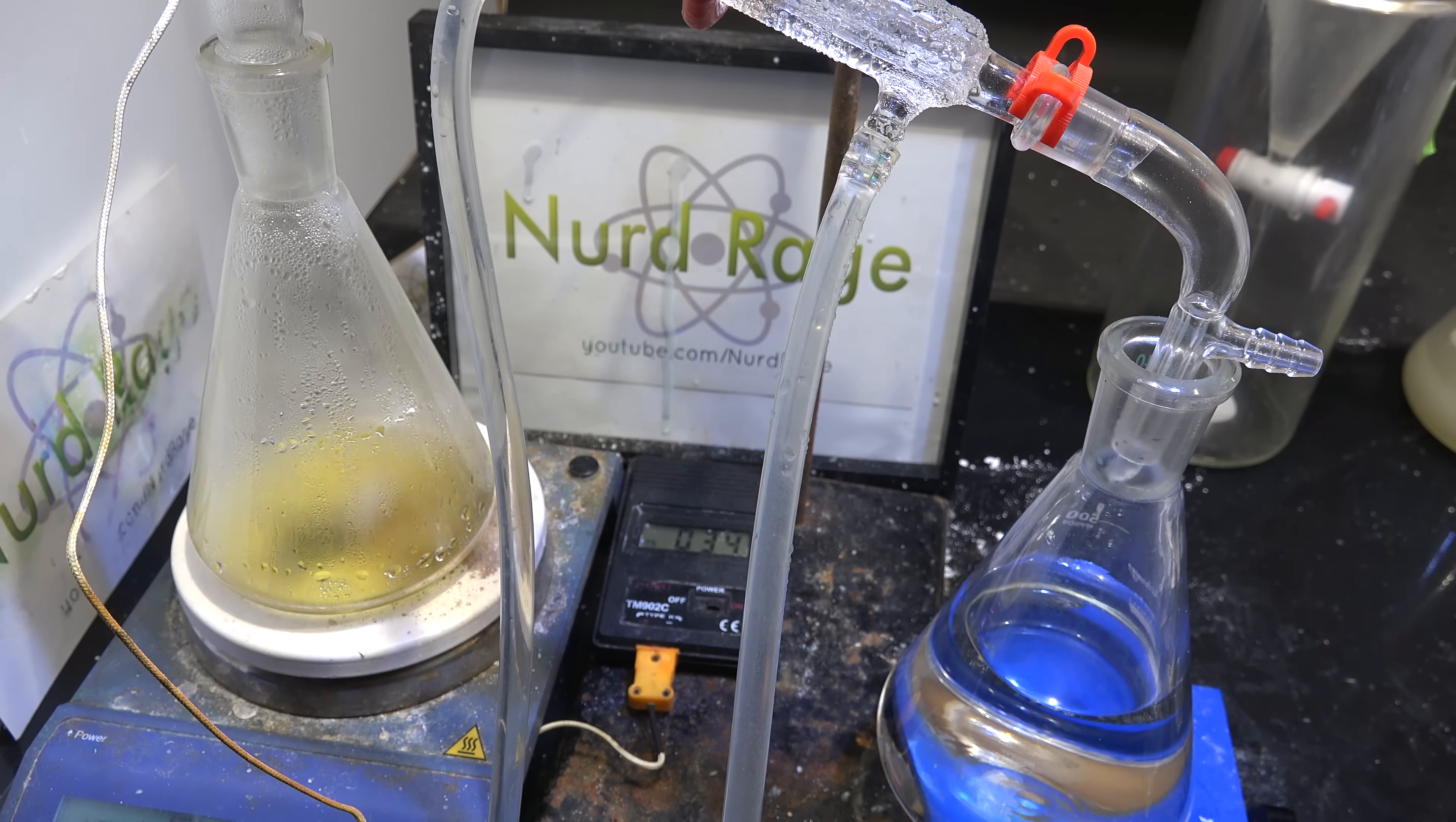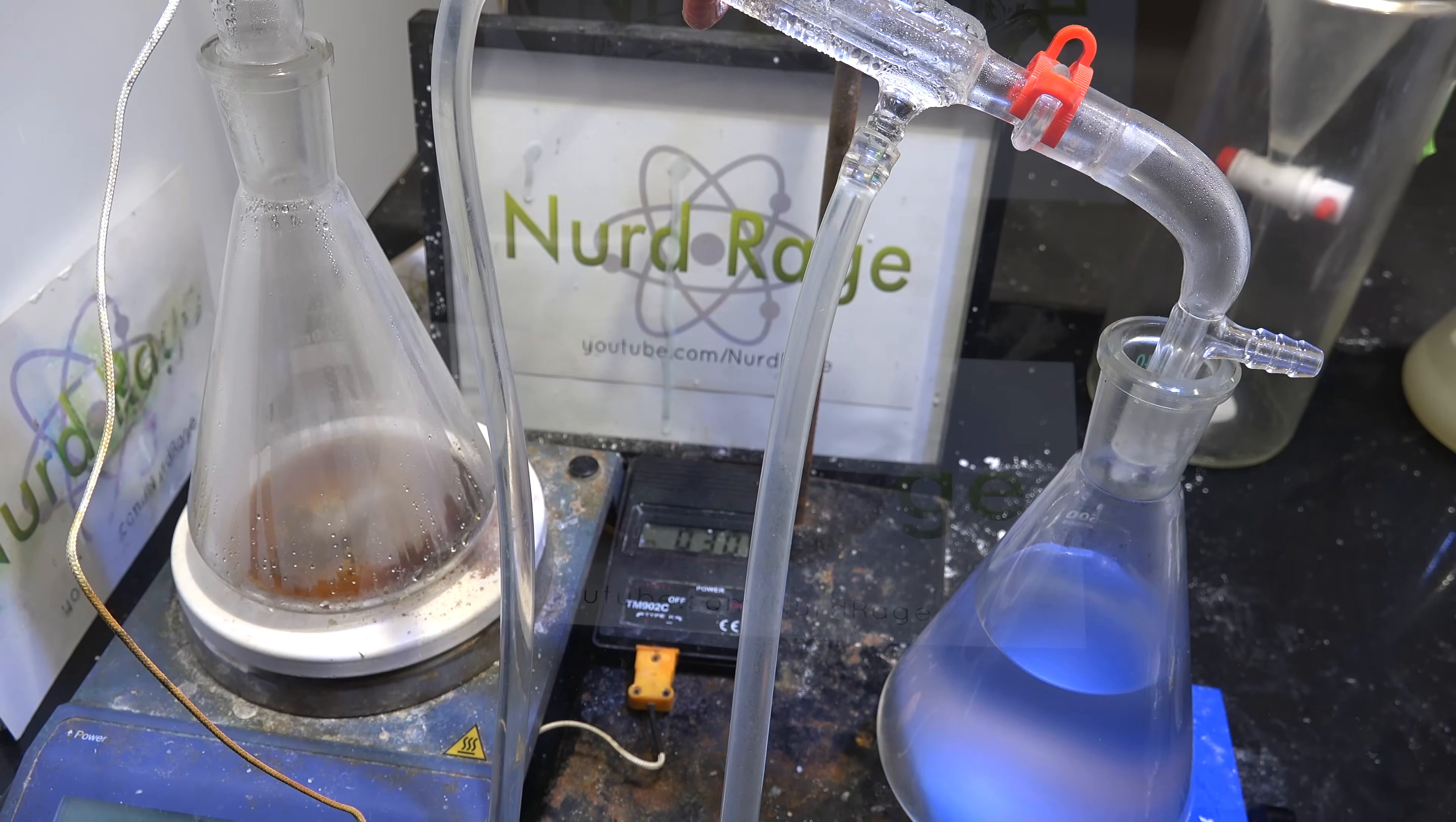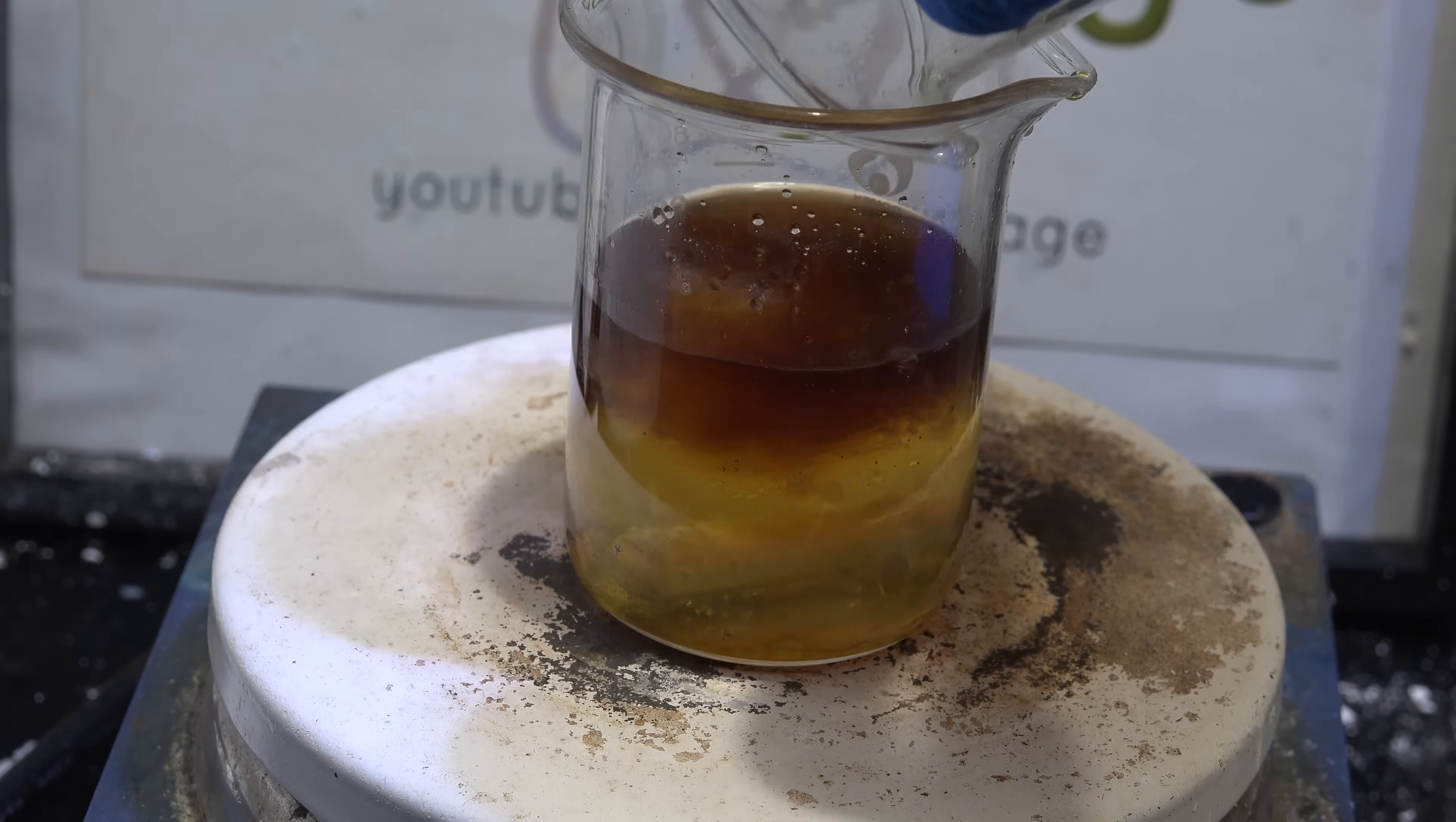Now I went a little too far with my distillation and charred my residue but this isn't a problem. Now at this point we have a syrup of gallium trichloride, residual water and ether. Gallium chloride actually binds ether pretty strongly so distilling it off is actually pretty hard. We need to get it back into water solution so add in about twice its volume of water.